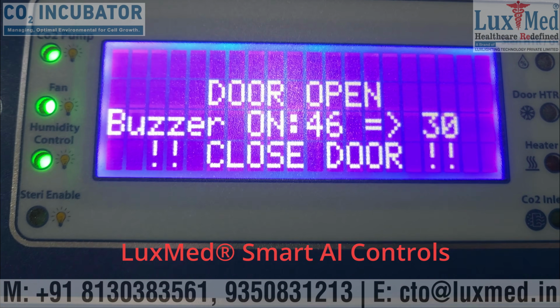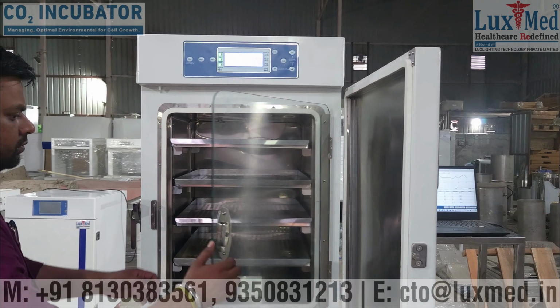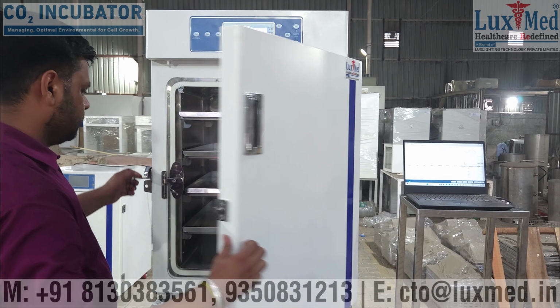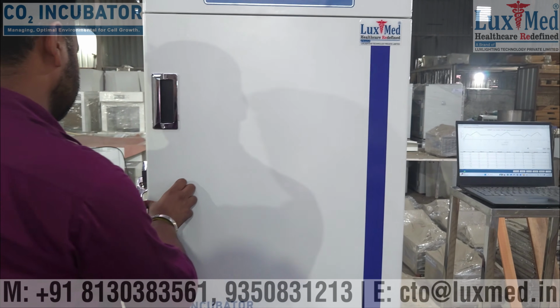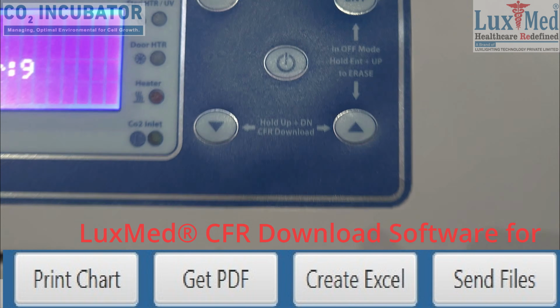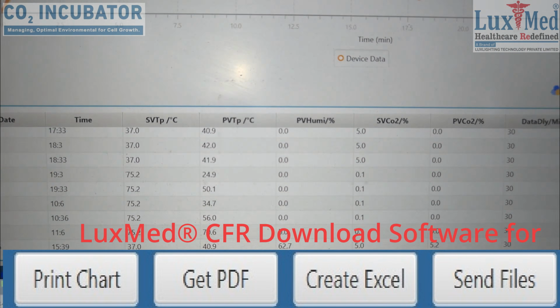CO₂ incubators are designed to create and maintain controlled environments for cell culture, primarily focusing on temperature, humidity, and CO₂ levels. These incubators use a closed system to regulate the atmosphere inside the chamber, ensuring optimal conditions for cell growth. Here's a more detailed breakdown of the key design principles.